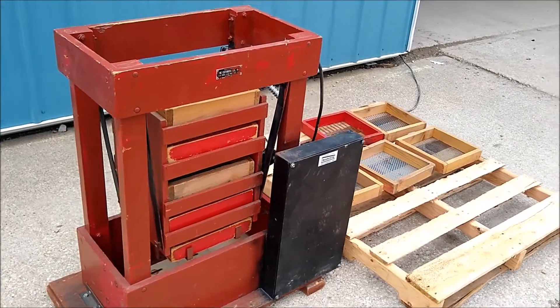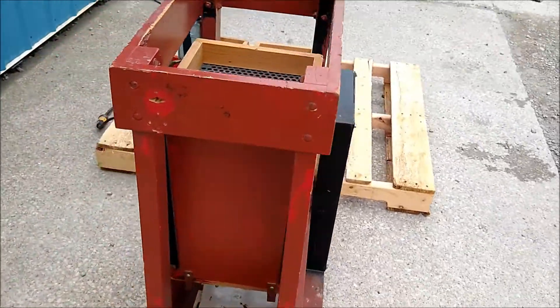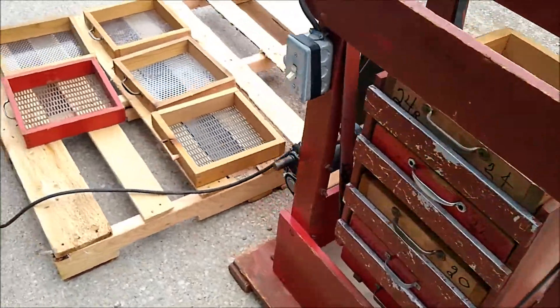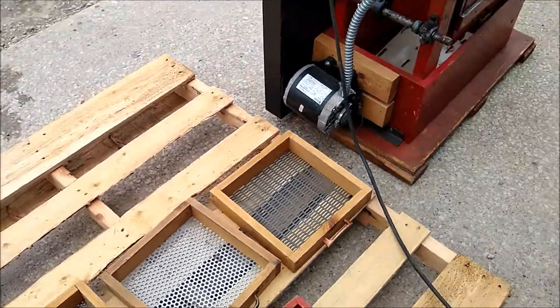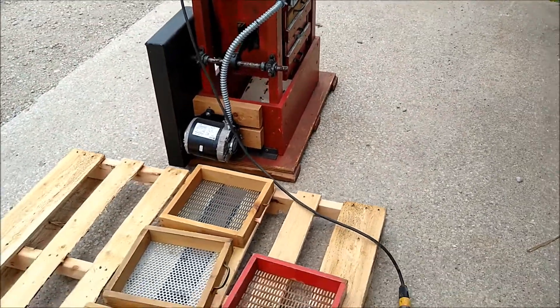Today we are looking at a Cuthbert Grading Testing Machine. It comes with several screens. It can be used on corn, beans, wheat, and other commodities.